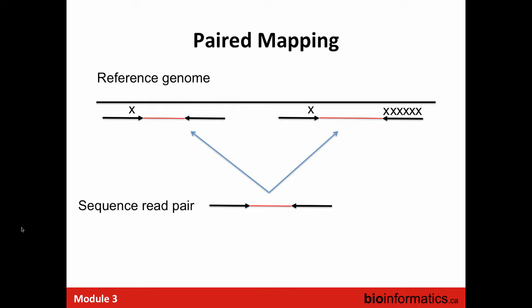It's usually tweaked for the different applications. It doesn't change much more than, say, 200 to 500 bases, just because it's really hard to get very long fragments to work on this like bridge amplification. So the upper limit usually sees about 500. I think the field is kind of standardized around 300 as being the common insert size.